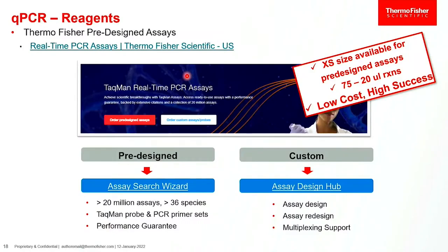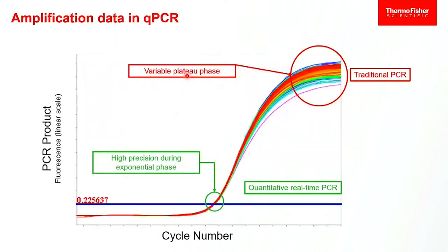So let's talk about the data we actually generate. It's actually the next slide. So when we generate data, what are we actually looking for? Again, we talked about growing that twofold target up in quantity. And again, this looks like flat background. It's growing, but this is our minimum detection, so it stays flat. It looks flat. You're growing, it's just not detectable. And then you get to the point where it really takes off, and this is the point where we want to do DNA quantification.